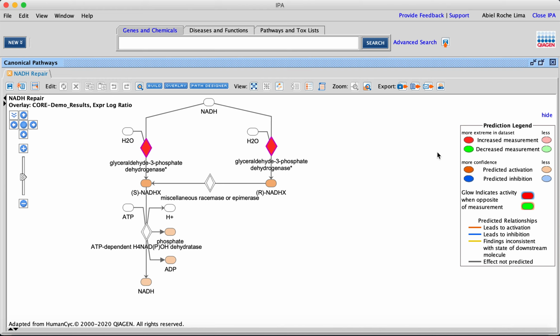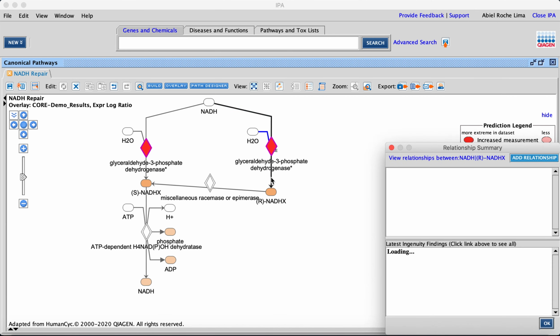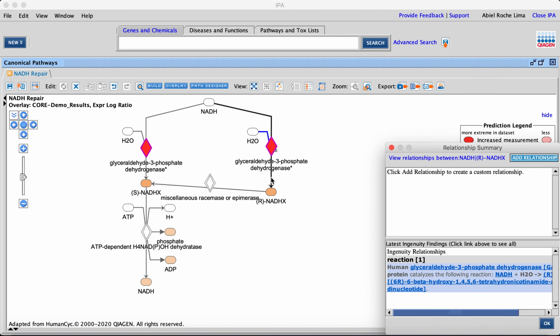It's inferred from what you are reading and observing in the data that it's doing the opposite. And those predictions can be observed in here. So of course, most of the pathway is being activated due to the upregulation or more abundance of this protein present in this pathway, which is proportional to the activation of itself. And we have confirmed this as well because each of these nodes can be accessed and has annotations, as well as the networks.